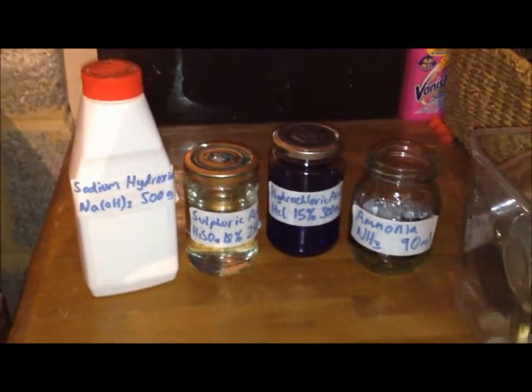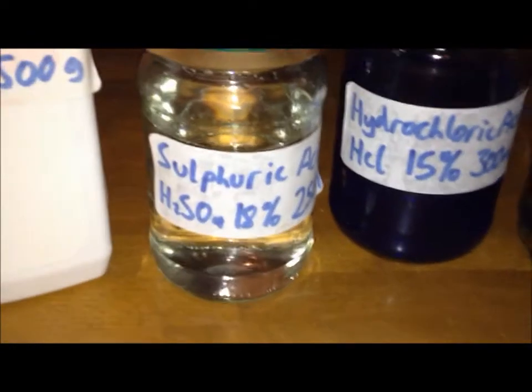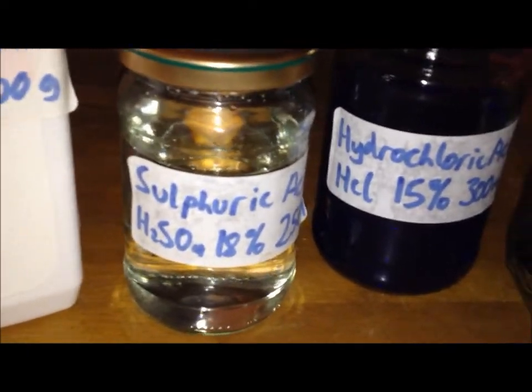Moving on to acids and alkalis — not the ones in my box, which are extremely weak. These are more concentrated. First, sodium hydroxide. I got this from Homebase and I think it's about 98% pure. You can also buy that from Boots. Next, sulfuric acid — it's very clean, 2 molar, so it's quite weak and very safe.